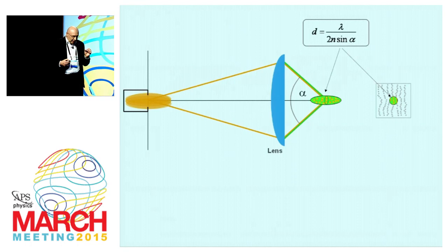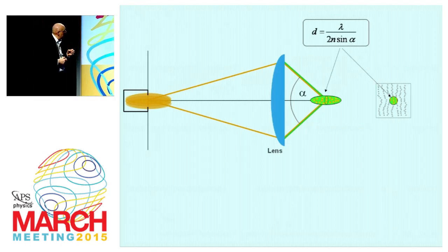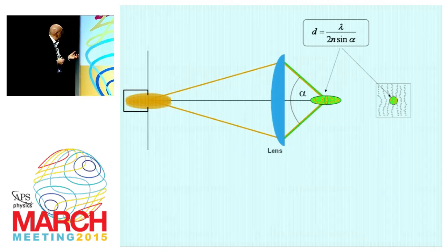Now, why was I so electrified? Let's get back to the problem. We have the objective lens and this diffraction blob here, 200 nanometers wide. And as I said, all the features that fall within that blob of light will produce fluorescence simultaneously here at the detector. And this is why we cannot discern the features in here.